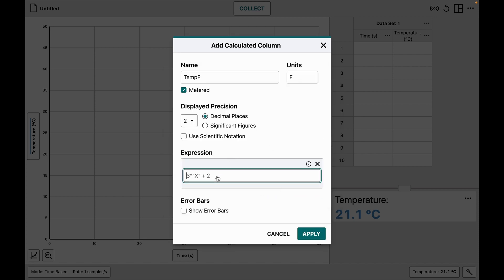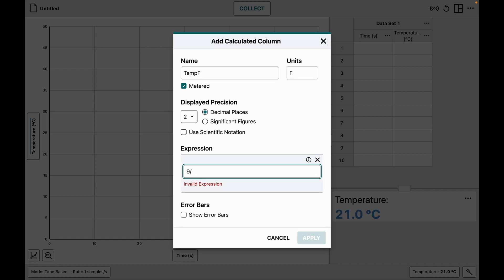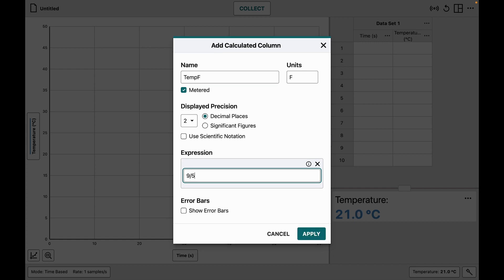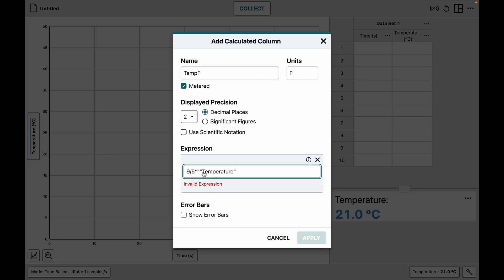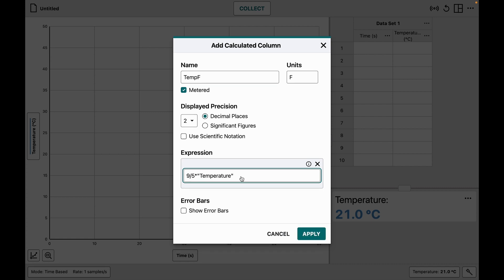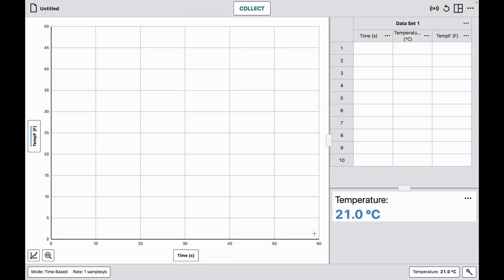I can now type in exactly the formula the way it looks: nine-fifths times the temperature column — which has to be in quotes, like in Logger Pro — and then I add 32 to that and apply.